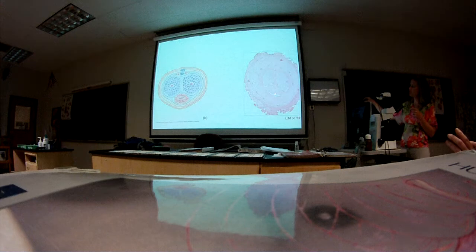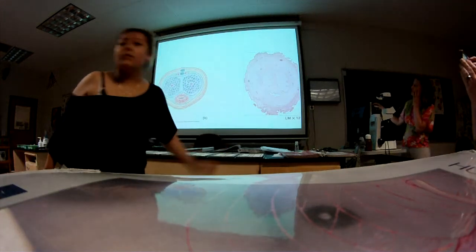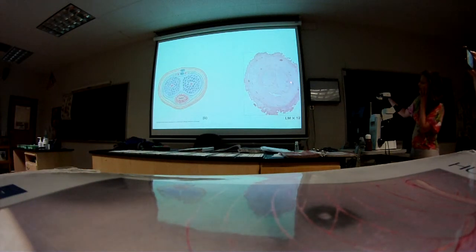Spongy urethra over here. Corpus spongiosum is the cylindrical structure. Okay, so these are corpus cavernosum, and the plural is corpora cavernosa. There's an artery in the middle of each. There is also a layer of collagen fibers that surrounds them and sort of separates them out, called the collagenous sheath, that goes around like this, in here, and a little bit in between.